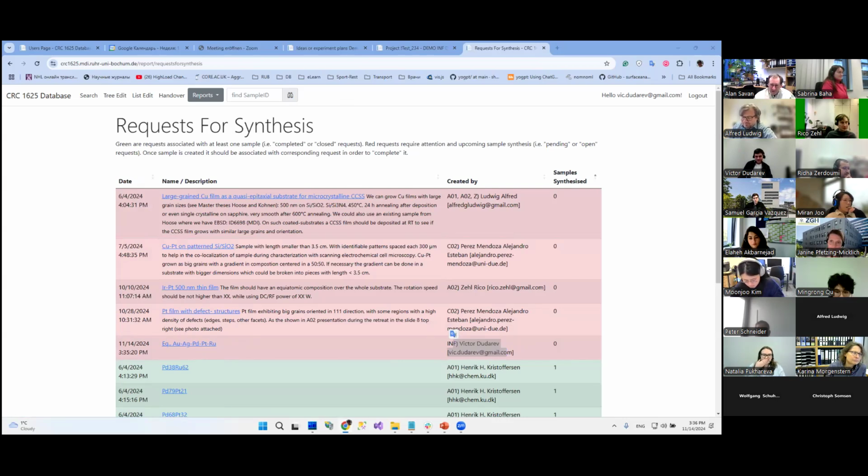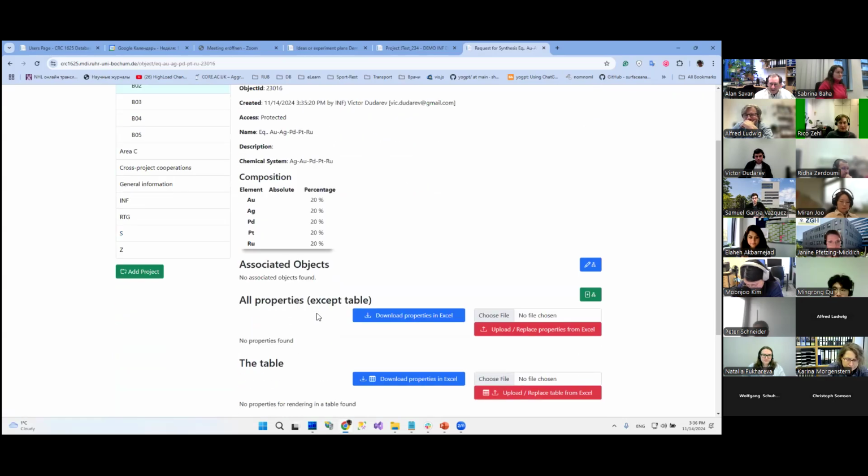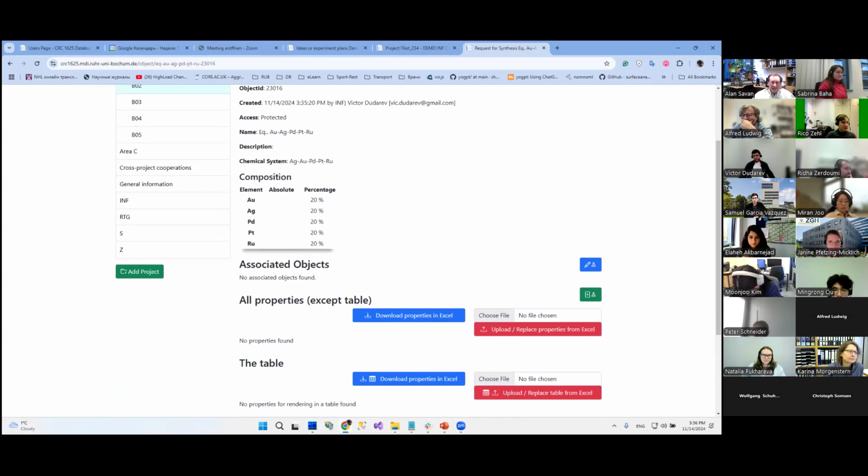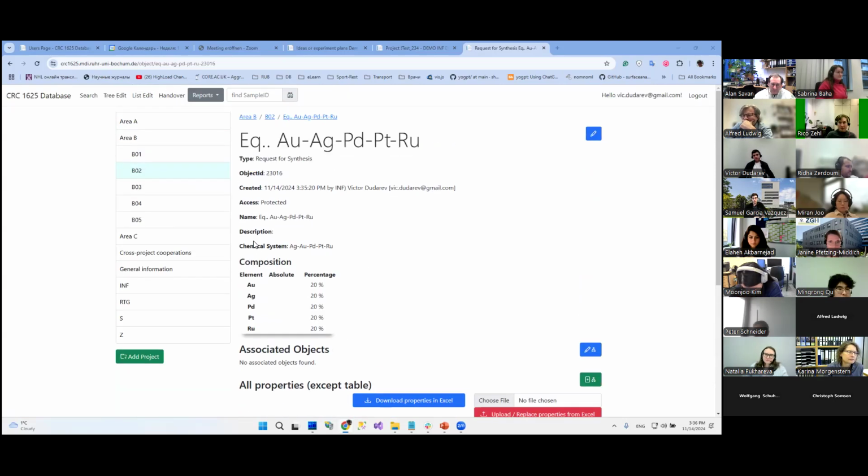One is where we're supposed to repeat something that's already been done, so it should be very close to what was previously done. And the other is we need a material with these 5 elements, and whether it's plus minus 5%, who cares? So there should be some communication about how important this percentage really means, exact or not. You're absolutely right. So you could specify this at least in a description and then probably use Slack to ask or negotiate all the obstacles, right?